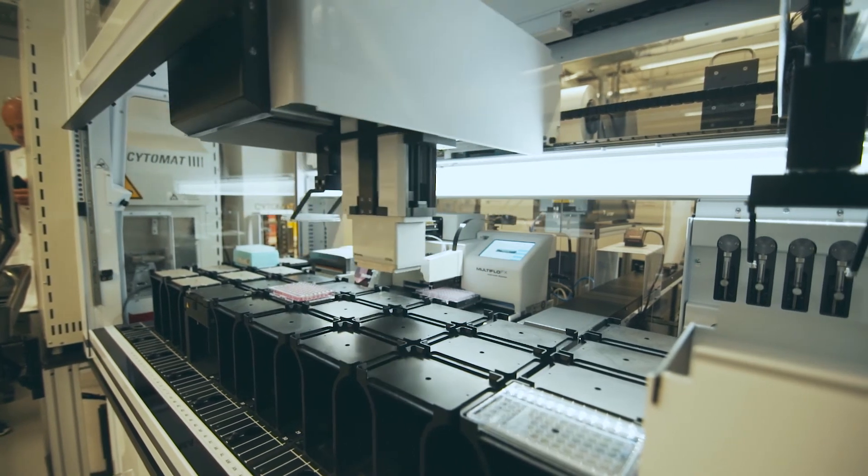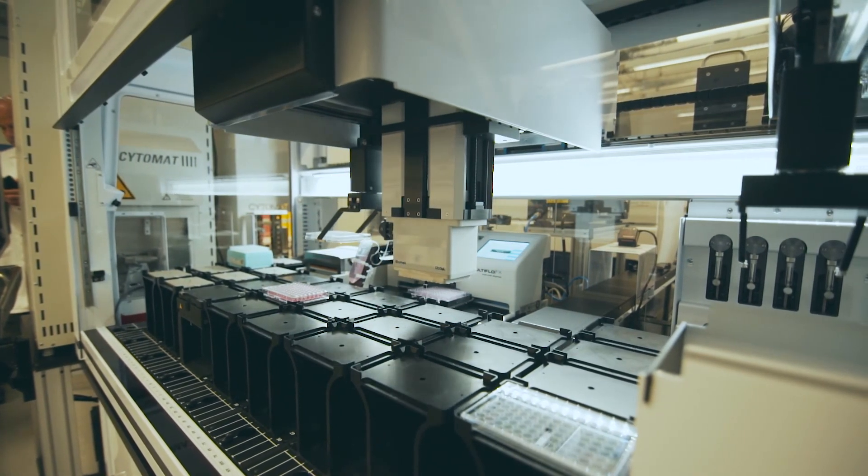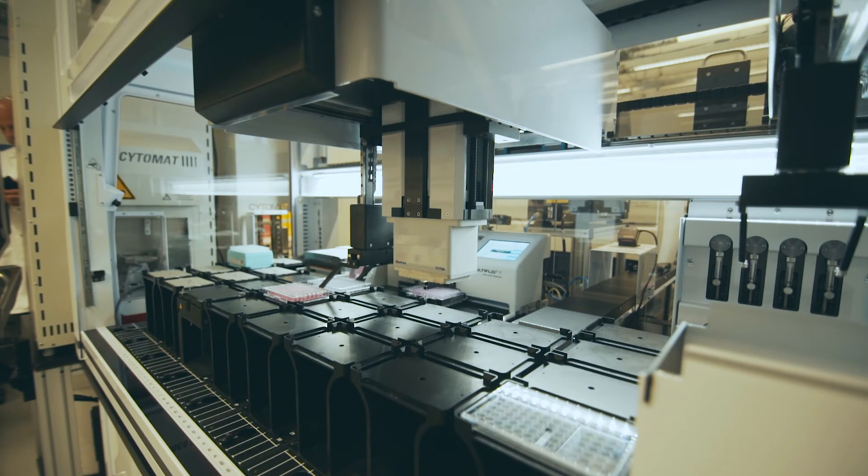The versatile nature of the Biomech workstations allow you to easily change the deck and devices, diversifying your method portfolio to evolve with the changing needs of your lab.